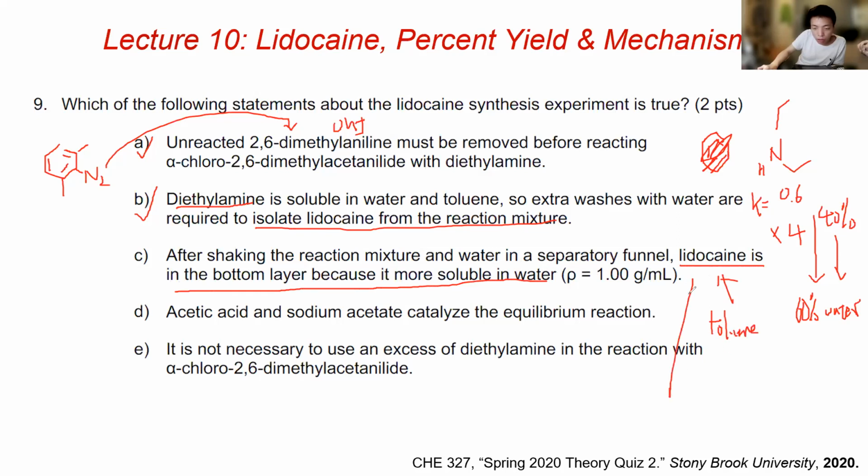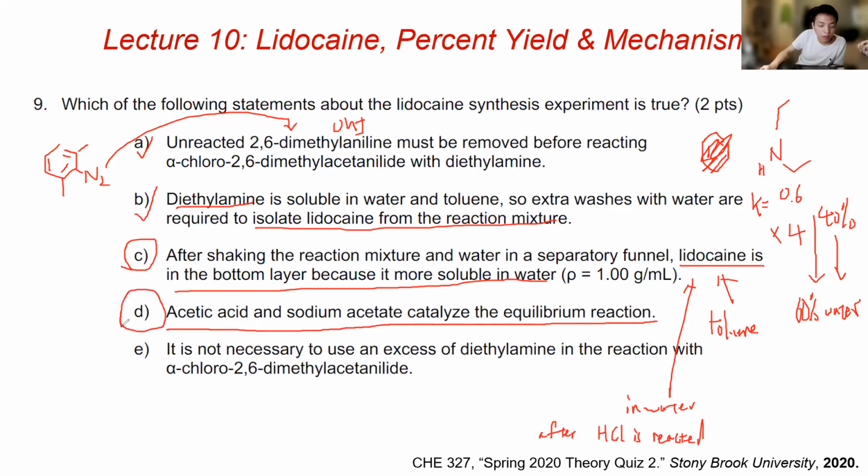It's only soluble in water after it's treated with HCl. Acetic acid and sodium acetate catalyze the equilibrium reaction. Yep, this one is true. This is in part A.